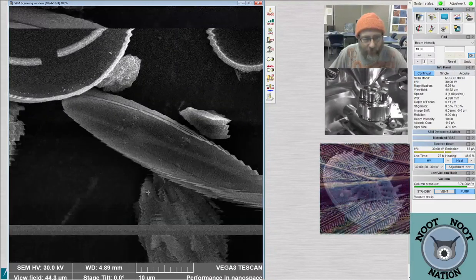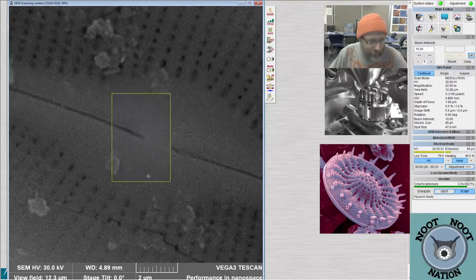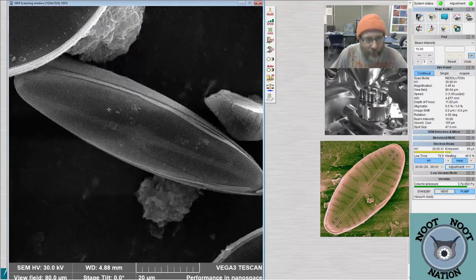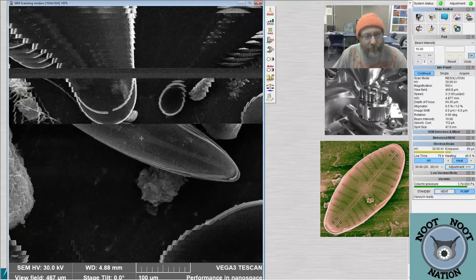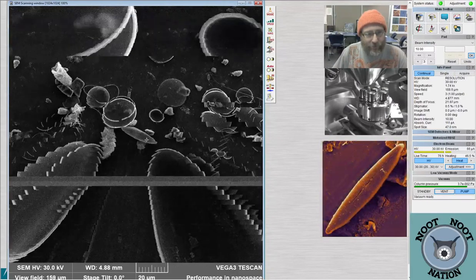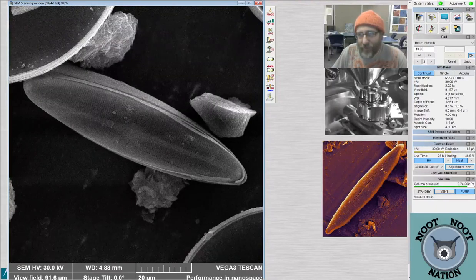Oh, this is, I think, a diatom that I was calling Scoliopleura, and I think that's what that is. And I told Pacific Plankton that if I saw one, I could collect an image for her. So I might just grab this one real quick while we're here, so we have it.